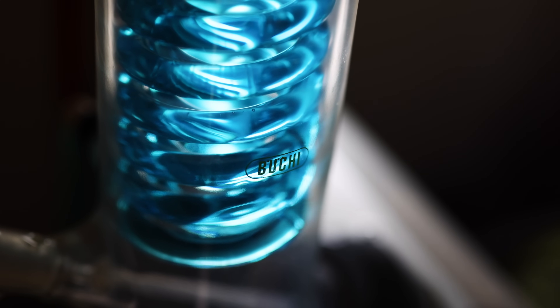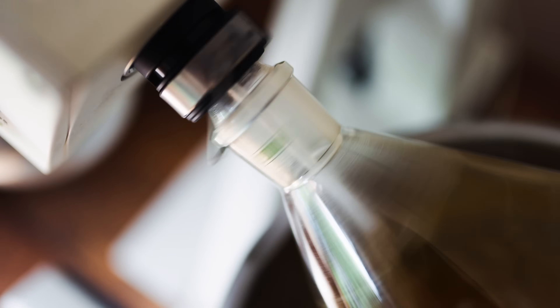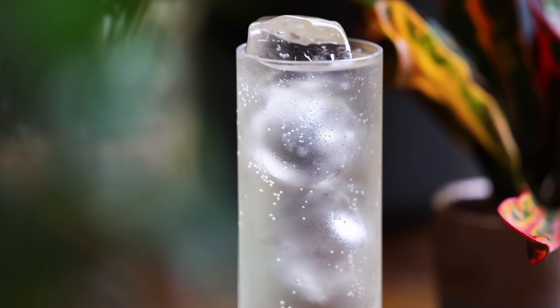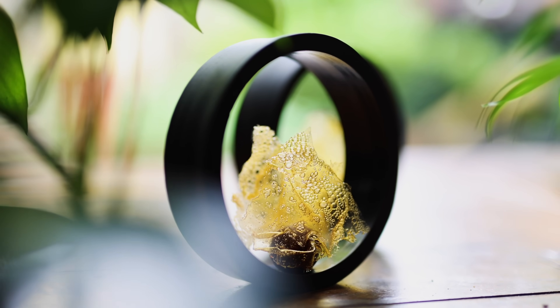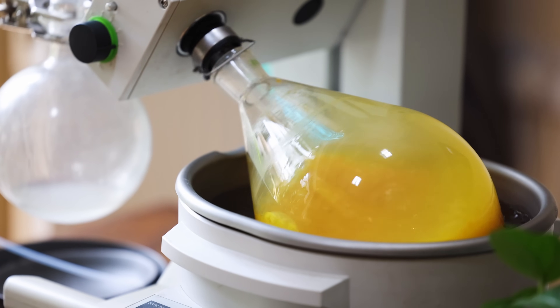I've owned and used a Buki Rotavap in my culinary and drinks work for nearly five years now, and it's something that quickly became quite deeply integrated into my cooking. The Rotavap is one of the things I get a lot of regular questions about. I definitely wouldn't suggest it's for everyone, but I love mine, and I thought this is a good opportunity to do an overview of the ways that I use it and a long-term review of my Buki R100 model.